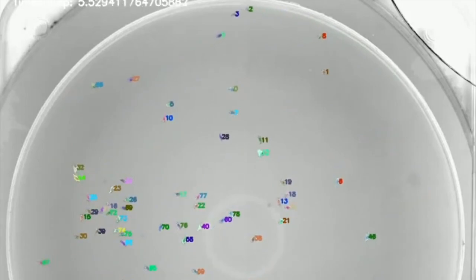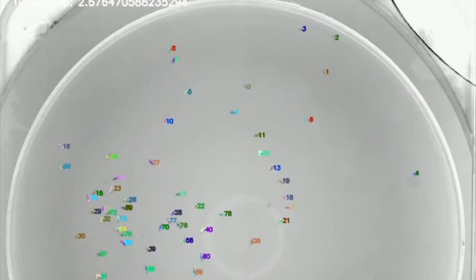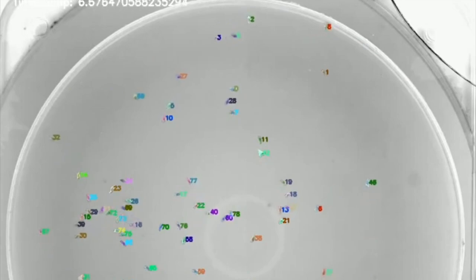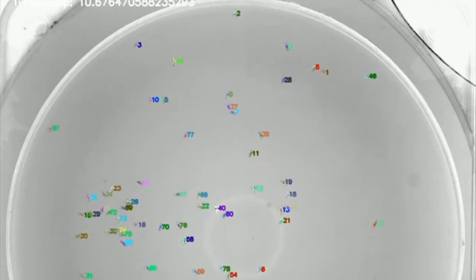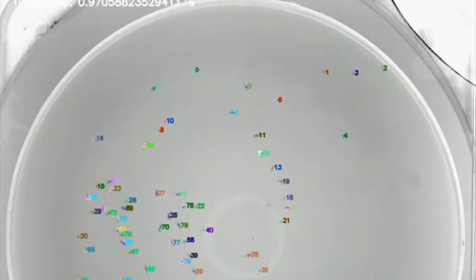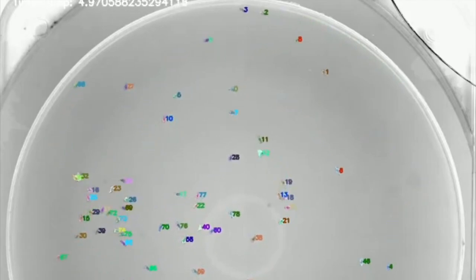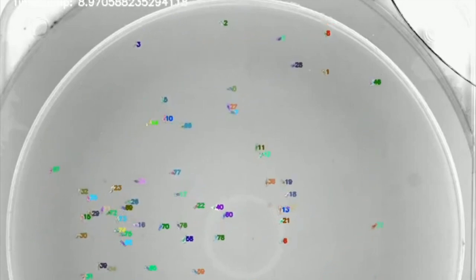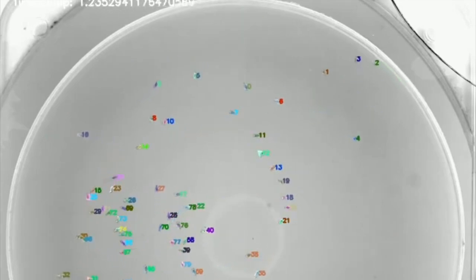I'm starting to see how valuable this could be for all sorts of research. But before we get too far ahead of ourselves, I want to hear more about those fruit fly examples. You mentioned they needed some corrections. Can you tell us more about how Annolid handled those more complex scenarios? The fruit fly examples are interesting because they really push the limits of what Annolid can handle. Fruit flies are notoriously difficult to track, even for humans, because they're so small and move so erratically.